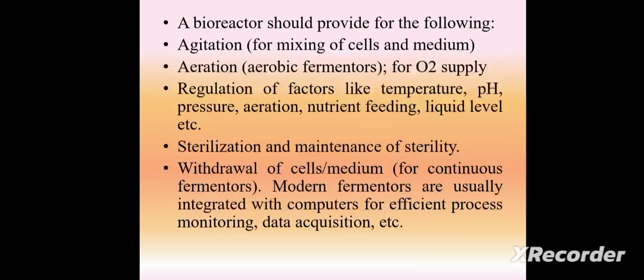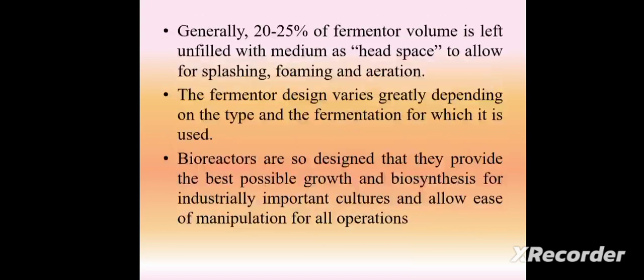The withdrawal of cells or the medium for a continuous fermenter. During continuous fermentation, there is continuous addition of the fermentation broth and removal of the product, so for that purpose it is important. The modern fermenters are usually integrated with computers for efficient process monitoring and data acquisition. Generally, 20 to 25% of the fermenter volume is left unfilled with the medium as headspace to allow for splashing, foaming and aeration.